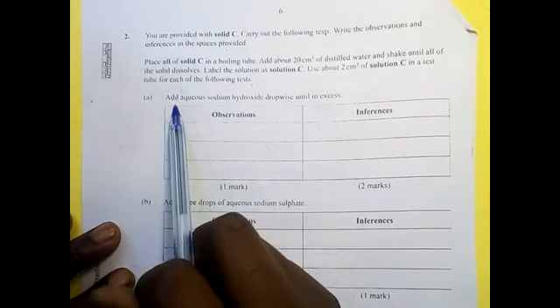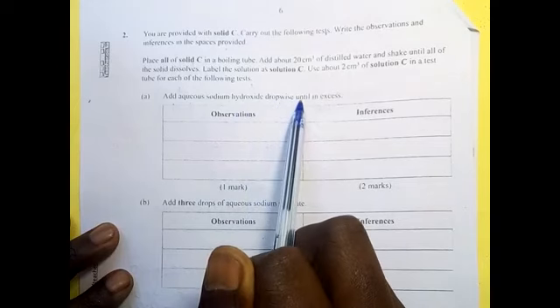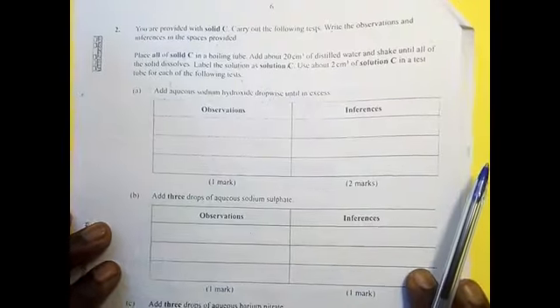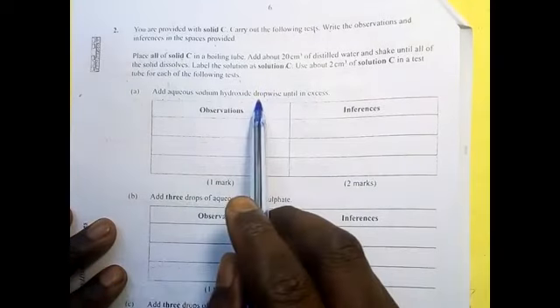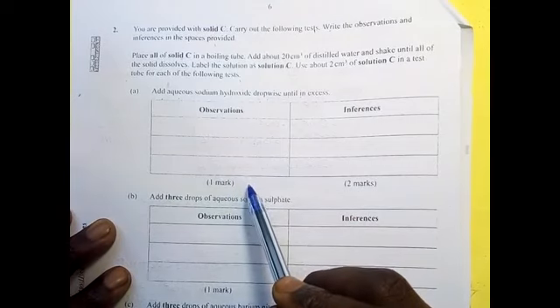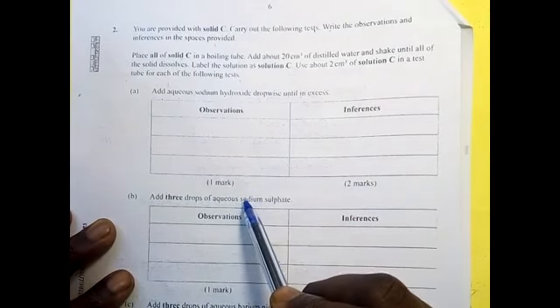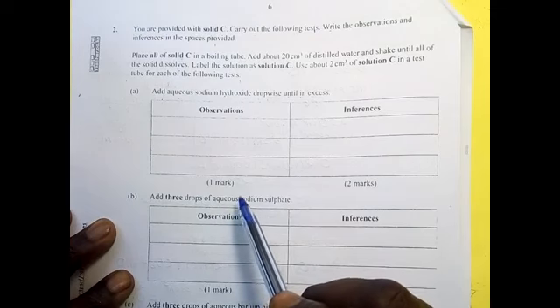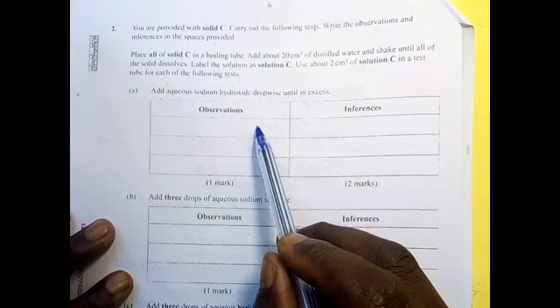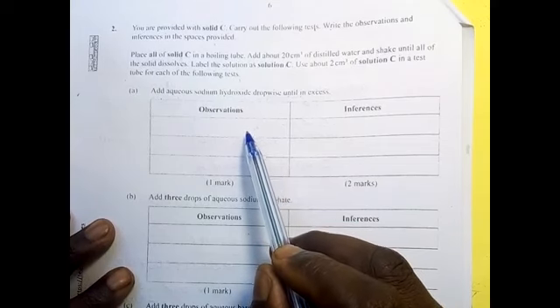A. Add aqueous sodium hydroxide dropwise until in excess. This is now where the students go wrong. When you are told to add dropwise until in excess, it means: first use 2 drops and make the observation, see what will happen, and afterwards add the sodium hydroxide in excess and make another observation, because here you are expected to make 2 observations at once.